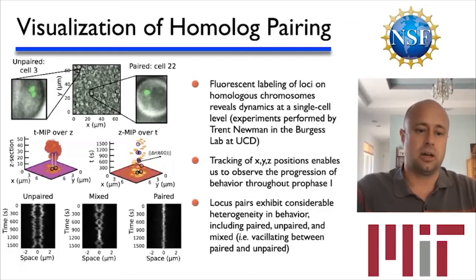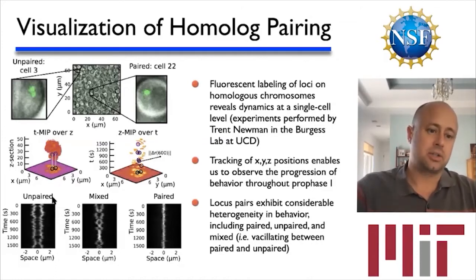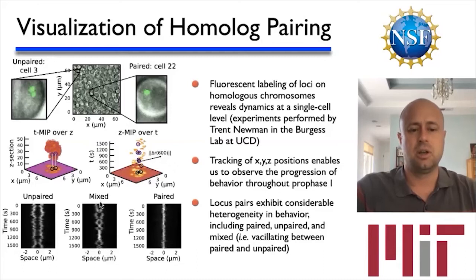Okay, and so what you actually see is that in the whole field of view, you see many of these cells, and they have two labels in some instances. Sometimes you see them paired with one another. But interestingly, there's a great deal of heterogeneity from cell to cell. In fact, you see that there are some of these cells where the homologous loci are moving dynamically, but they never really seem to form a pair. They seem to be unpaired throughout the process of observation. Whereas there's a mixed population where they undergo pairing and then unpairing and pairing and unpairing as a sort of dynamical search process. Whereas then there's a family where they just are paired and they remain paired throughout that time.